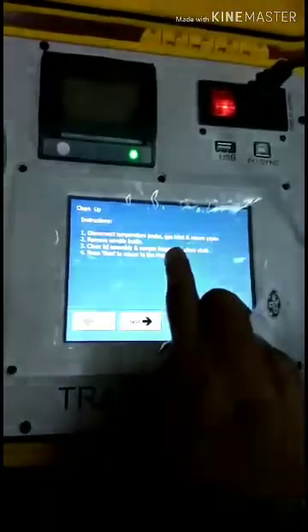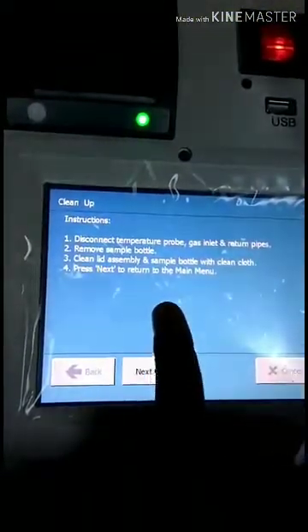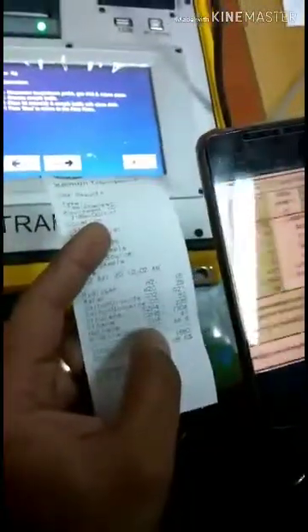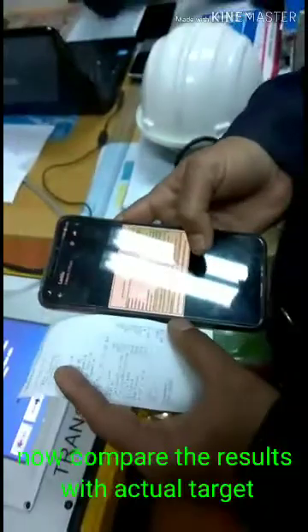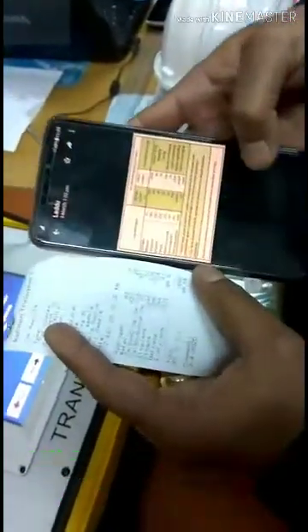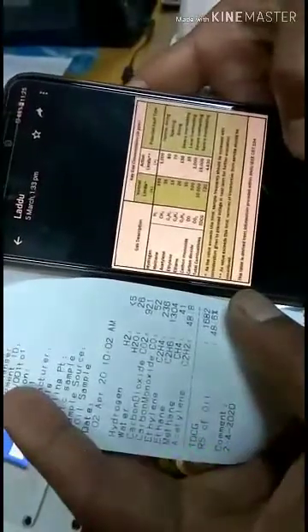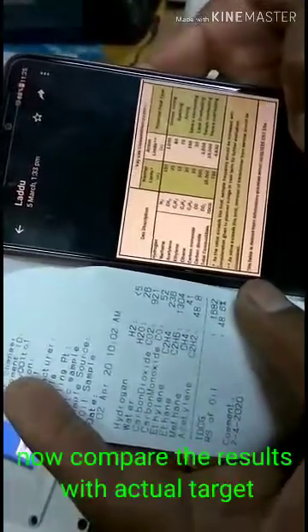We have all this kind of program gas — and it is another financial overview, right corner. You did a generator one game, the comparison. Okay, now has to achieve a little — I only normally 150, okay. H2O water chasing.